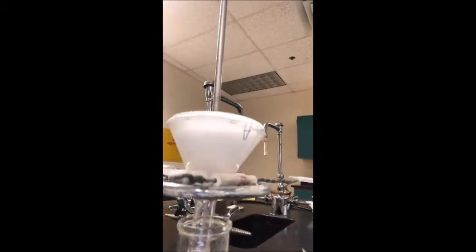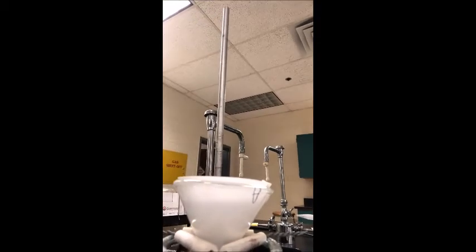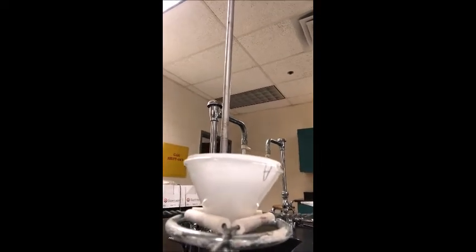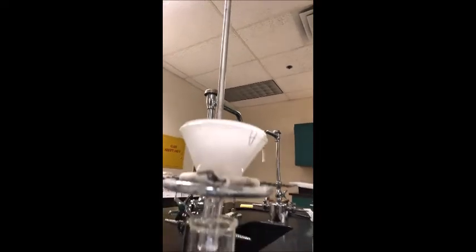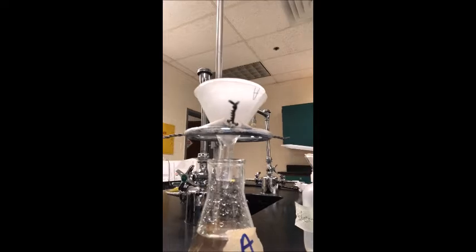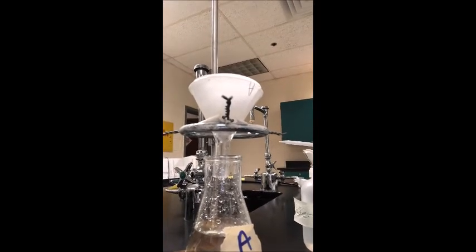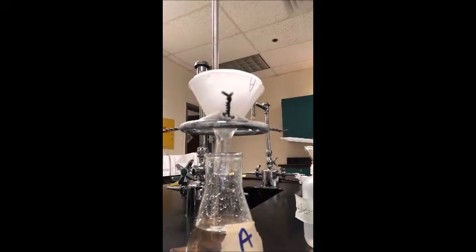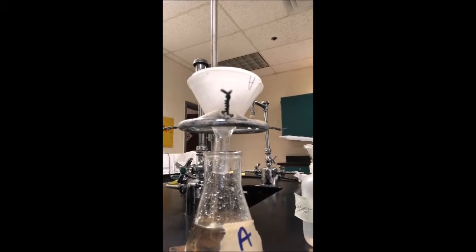And then I'm going to take my filter paper and put it on a watch glass and put it in the oven to dry. And then I have to come back tomorrow to actually find the mass of the filter paper with the precipitate all dried out on it. So that's pretty much the setup. It's a time-consuming lab, definitely, because it takes a long time to filter. So you can see it going on. I'm gonna wash it 2 more times. I'm gonna do B and C as well, exactly the same way. Put them all in the watch glasses to dry overnight, and then be able to come and check out the mass on the next day.